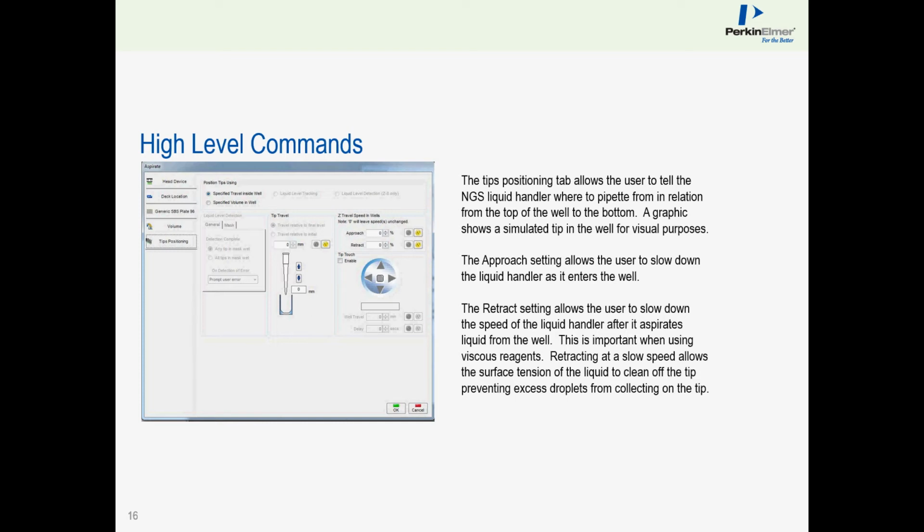And essentially, because we have all that information stored in the consumable database, the values that we give for the depth are actually controlled and limited by the actual consumable depth. So if the actual depth was 14.5 millimeters, you wouldn't be able to say, oh, let's go to 20 millimeters, because essentially the software is preventing you from making a mistake and crashing through anything in here.